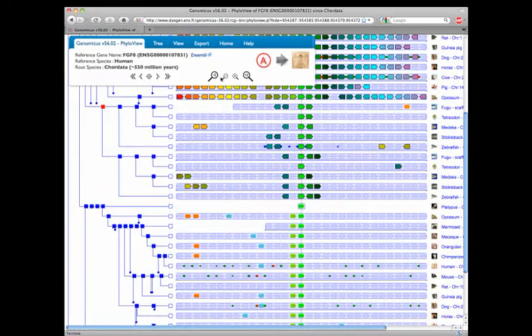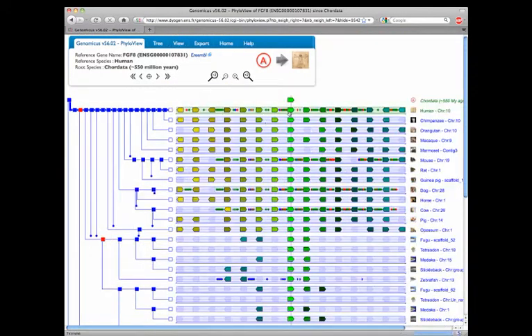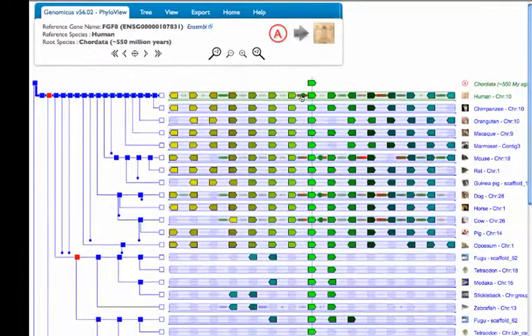I can zoom in by clicking here to show half the amount of genes on either side. Now I see many smaller symbols in the regions between genes which correspond to conserved non-coding sequences, CNEs for short. The green ones are conserved among mammals, the red ones between mammals and birds, and the blue ones the most stringent between mammals, birds, and fish. The circles represent CNEs located in the intergenic region, where it is displayed, whereas the square-shaped ones are in fact located in one of the introns of the gene immediately to the left of the CNE.